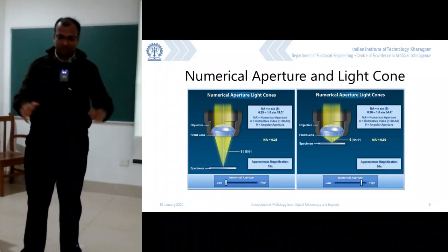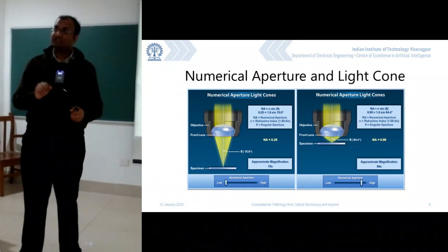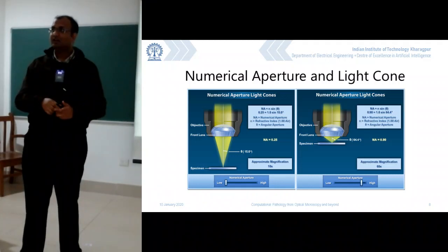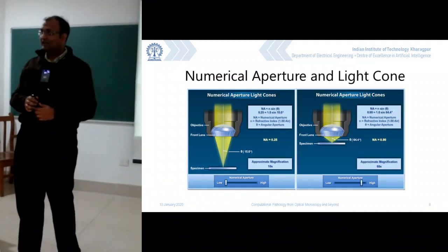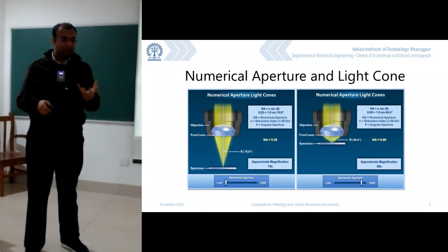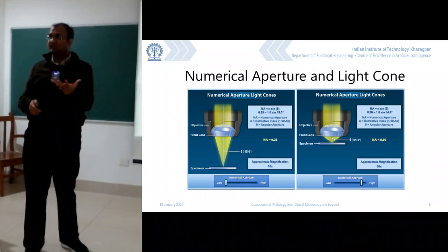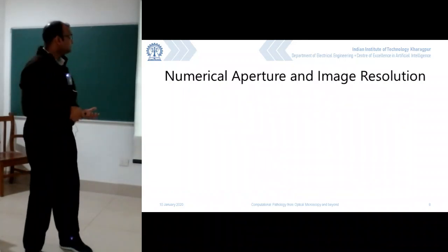Whereas if you are doing it on that manual one from Leica, then you have to change the lens, plus you will have to change the aperture as well. There was an aperture knob which they were changing, if you were very observant. And this is really needed. Otherwise what happens is that your sample is still the same, you just change the lens, but everything becomes darker. So this has to really be taken care of.